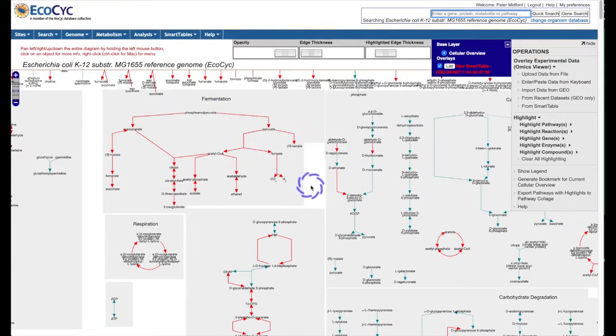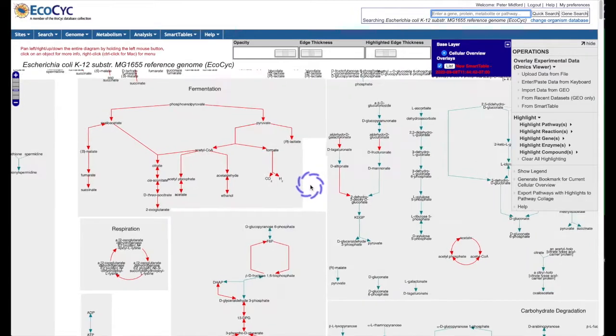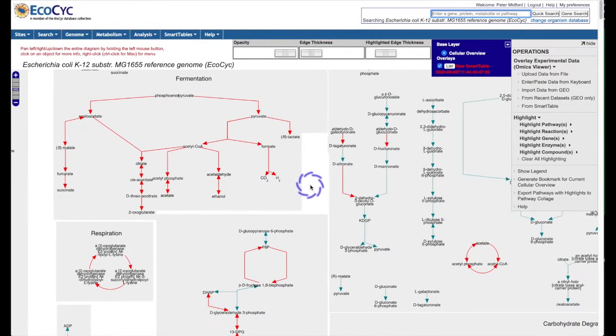This shouldn't be a surprise since this is a study involving aerobic and anaerobic metabolism, and you would expect that a lot of genes associated with fermentation are significantly changed in the original data set, and therefore their reactions appear in this filtered data. I can zoom in and out with the mouse wheel. If I zoom in far enough, it starts to show the names of some of the pathways.